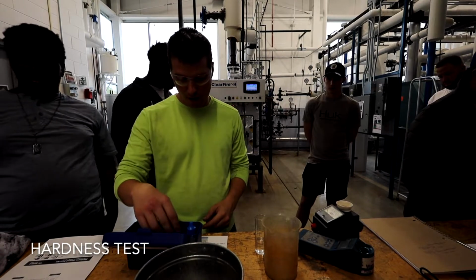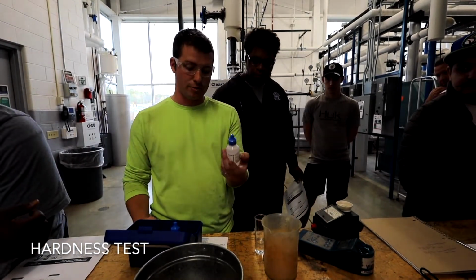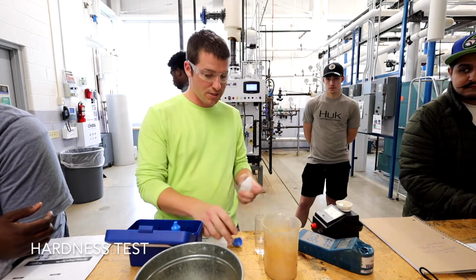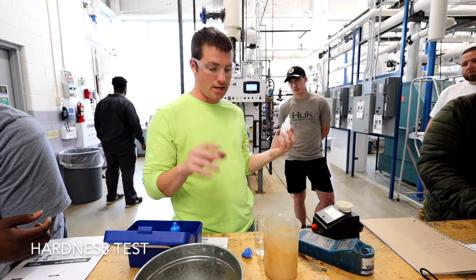Add 5 drops of our hardness buffer and mix. So you're going to look in here, you're going to have one that's labeled hardness buffer solution, okay? That's what it's talking about. And so we're going to go ahead and add 5 drops. If you accidentally add 6 drops or 7, it's not going to ruin the test.